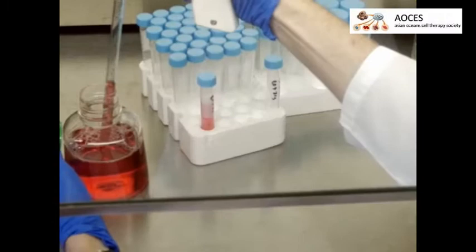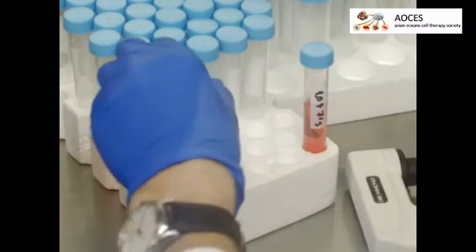Count the cell suspension using a cell counter. Dilute the cell suspension to 500 to 1,000 cells per 20 microliters in culture medium.